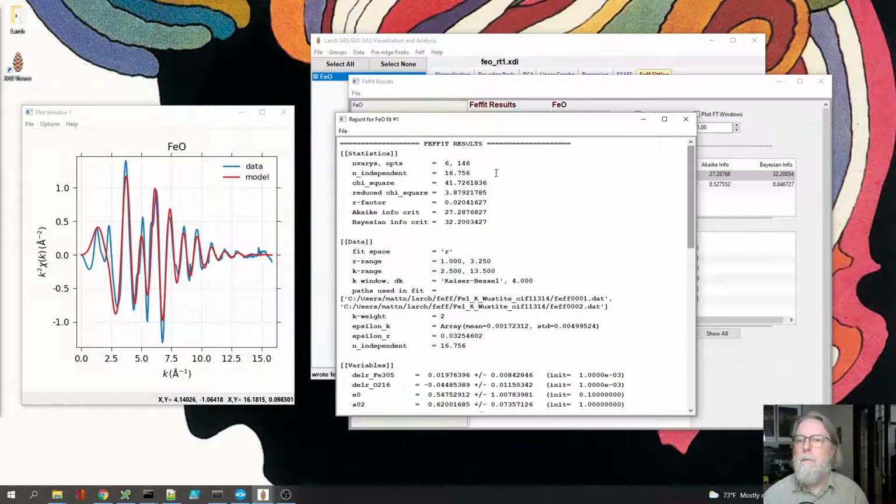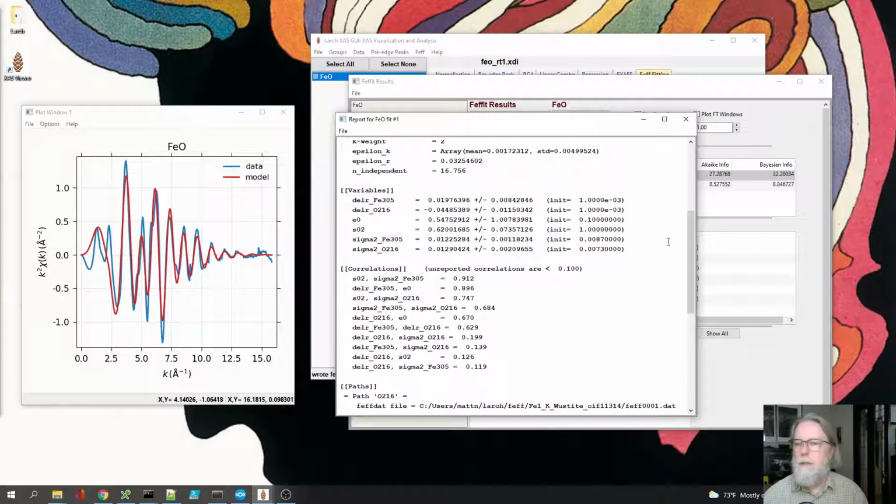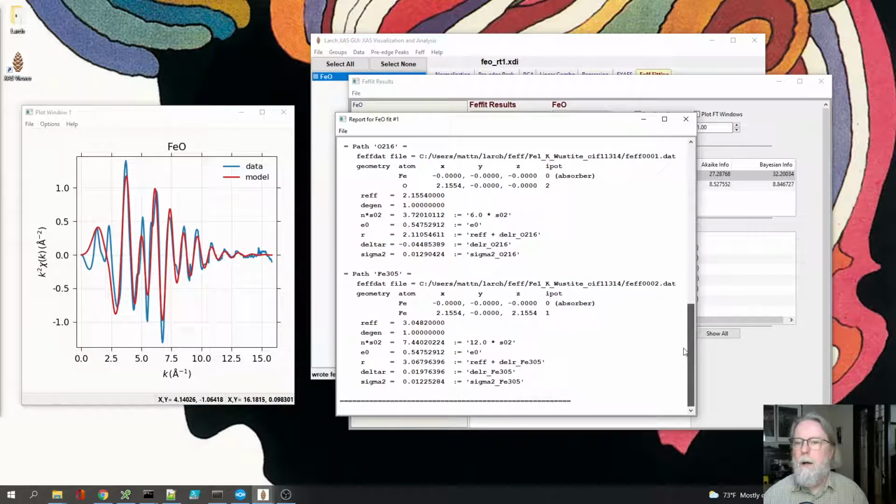And if we look at our parameters page, or our simple report page, all of those numbers are here, and it also gives a nice table of values for R, now refined to 211 instead of 216. So that's definitely further in than I would like to see for something that was a standard that we thought we knew we had characterized well. And R for iron seems perfectly acceptable.